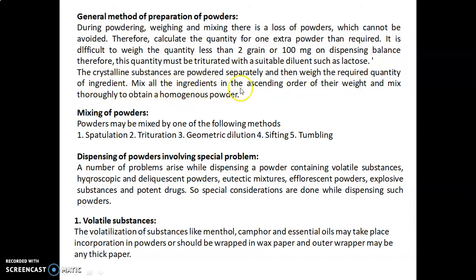Mix all the ingredients in the ascending order of their weight and mix thoroughly to obtain a homogeneous powder. Mixing of powders: powders may be mixed by one of the following methods, that is spatulation, trituration, geometric dilution, sifting and tumbling. Dispensing of powders involving special problems.